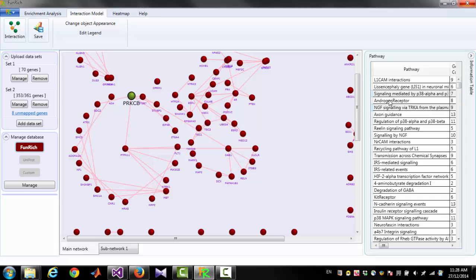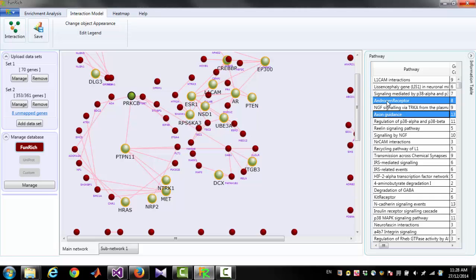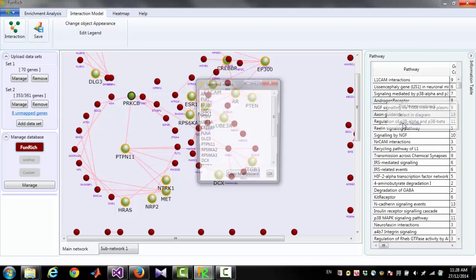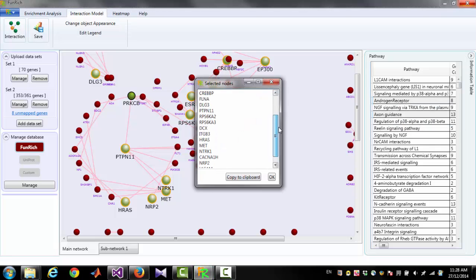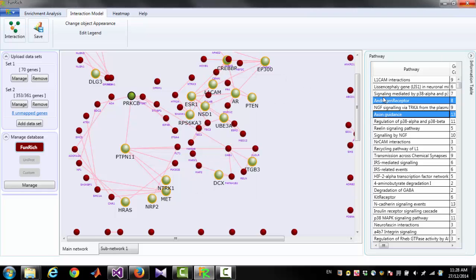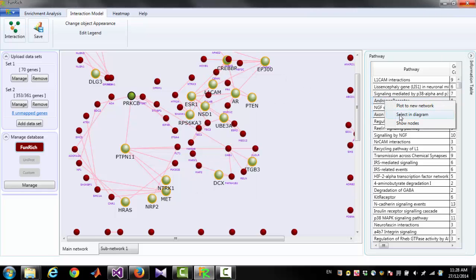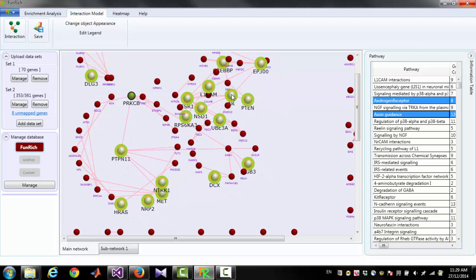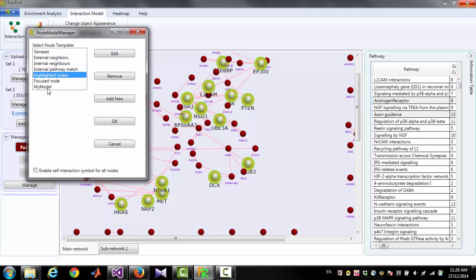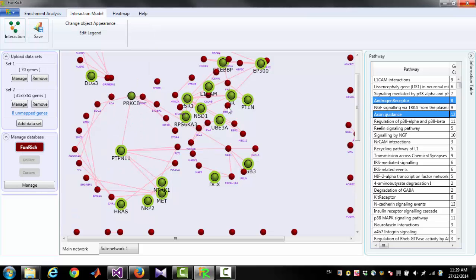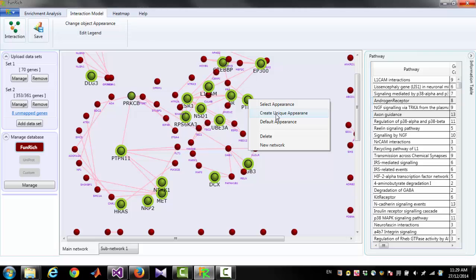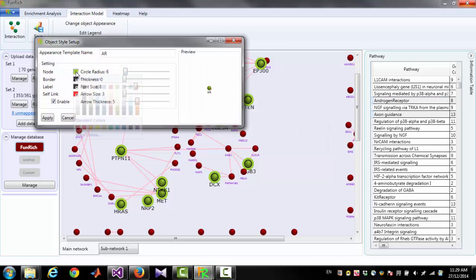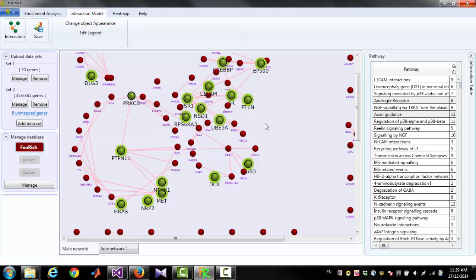On the right side of the diagram, you can select one or more pathways and click 'Show Nodes' to get the list of genes associated with those pathways. You can also click 'Select in Diagram' so the associated genes will be selected in the diagram. You can then move them, select appearance, or create a new appearance for those nodes.